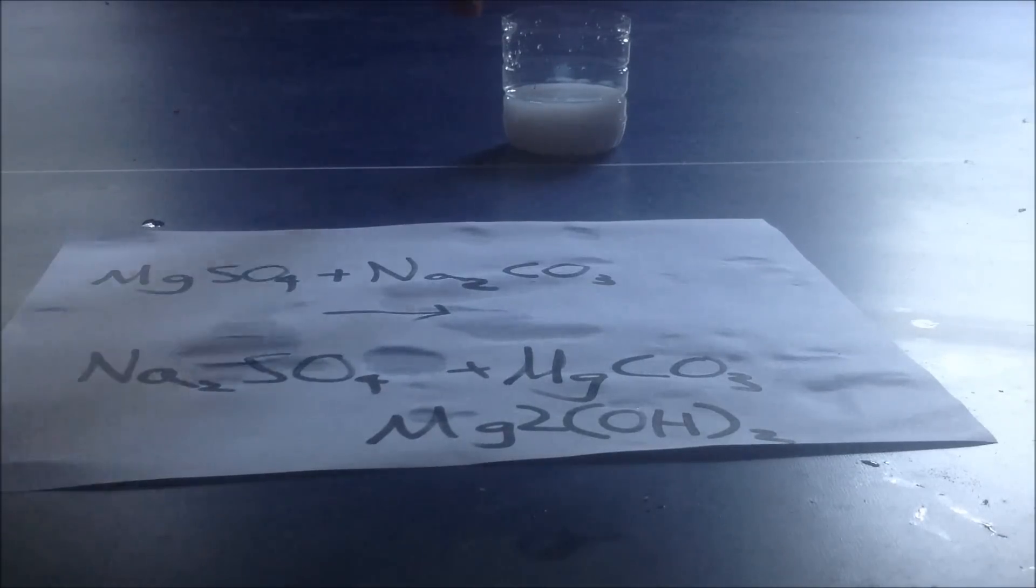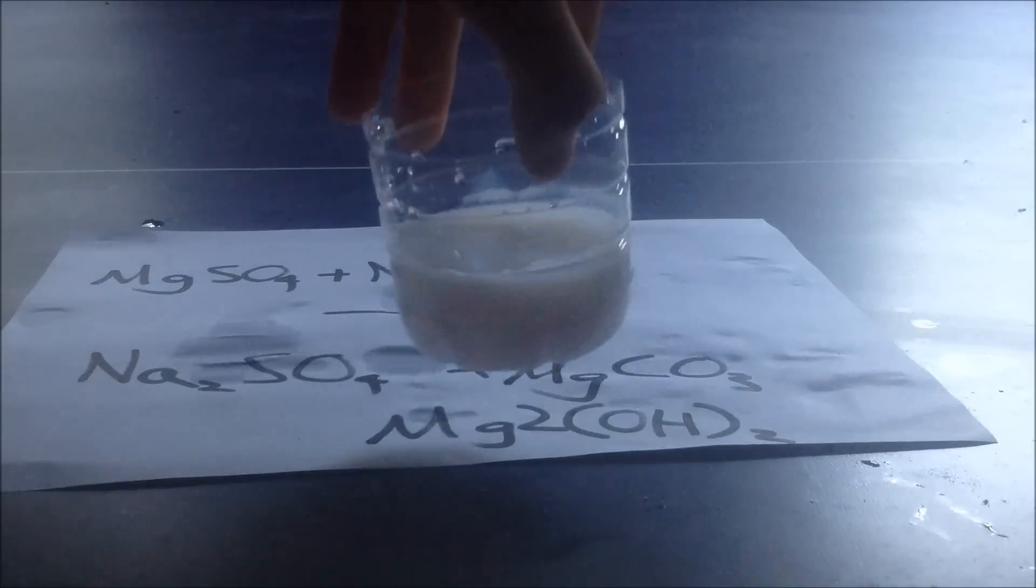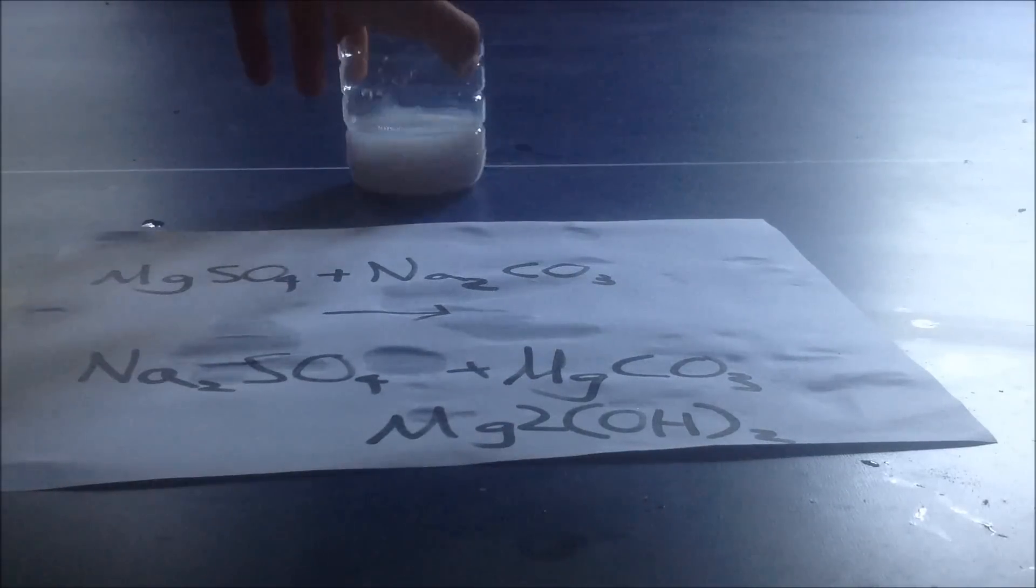And that's why this becomes milky white and looks exactly like dairy milk. Sorry for my pronunciation. So that's all. It's a great reaction to demonstrate precipitation.